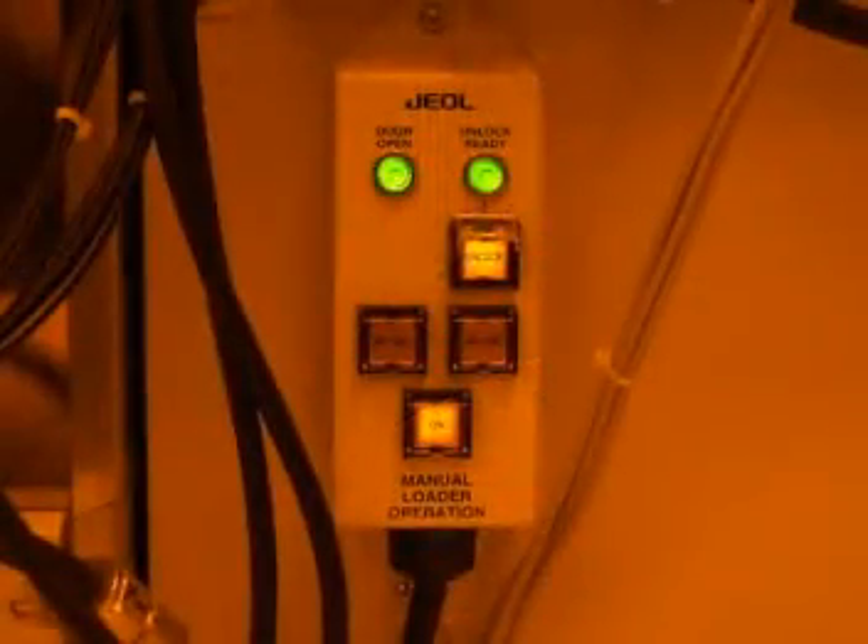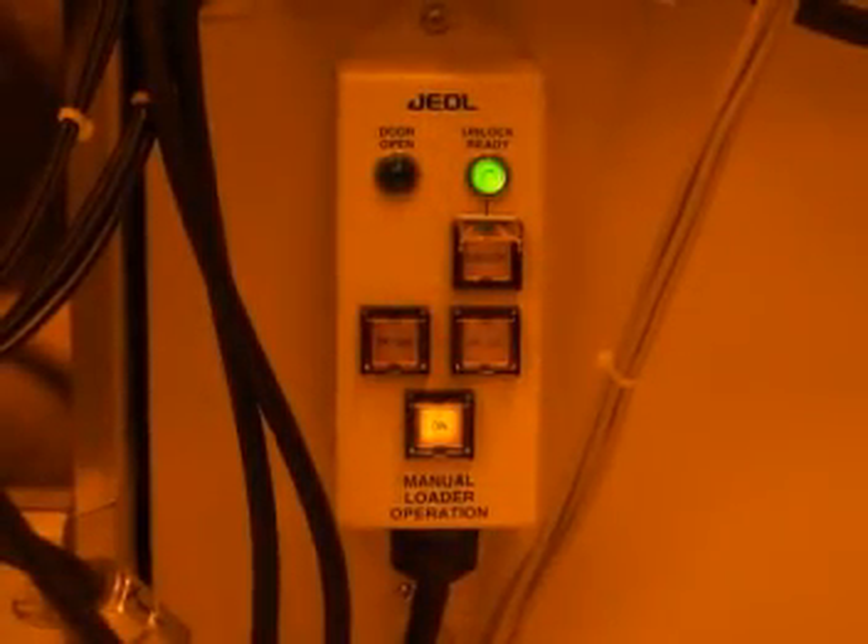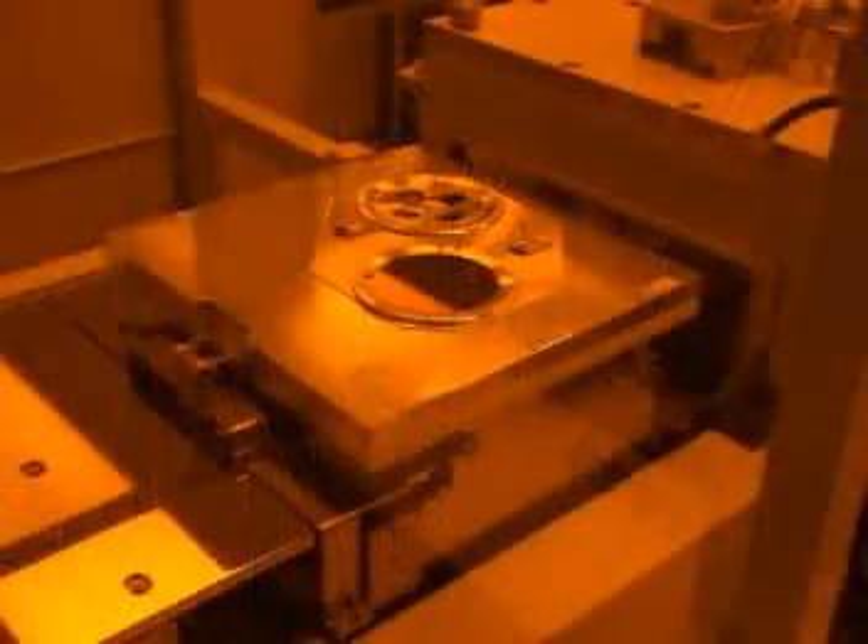Do not load the cassette upside down onto the platform. Doing so can cause damage to the cassette or the entire unit. Once the cassette is in position, close the door and hold it closed for a few seconds until the green door open light turns off.